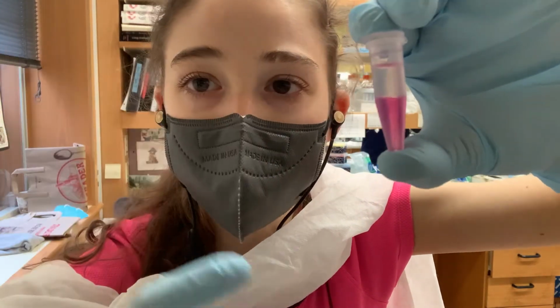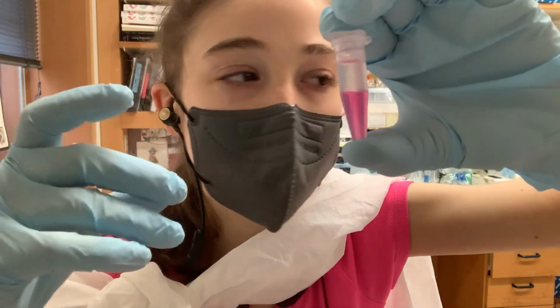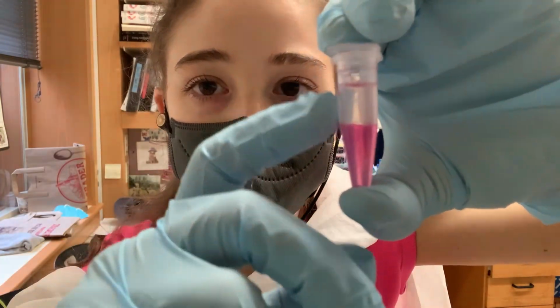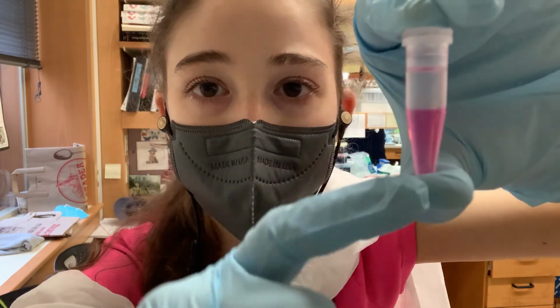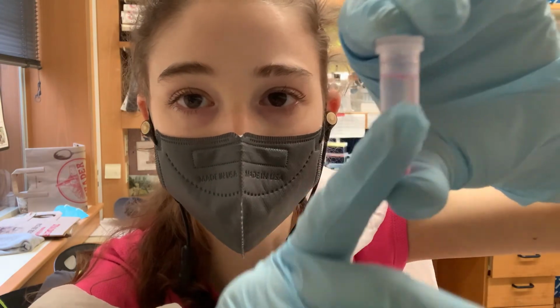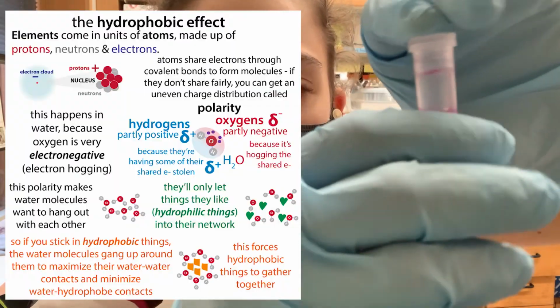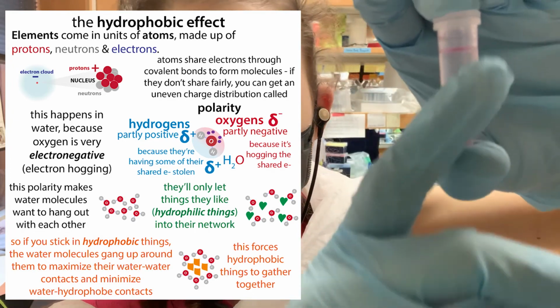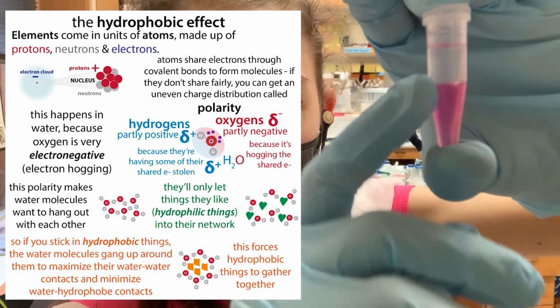So the basic idea with a liquid-liquid extraction is that you have two phases. Here we have this aqueous phase, which is all watery, and then down here we have this organic phase, which is where the phenol and chloroform and other stuff hang out. This is where the hydrophobic stuff hangs out, the stuff that water doesn't like. So water is going to exclude all of that, and that's all going to be here.